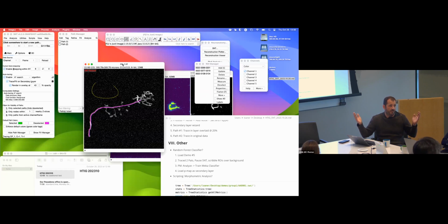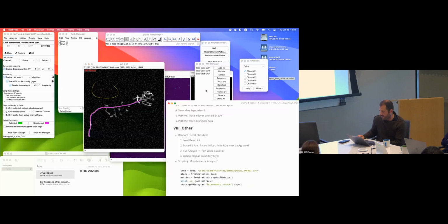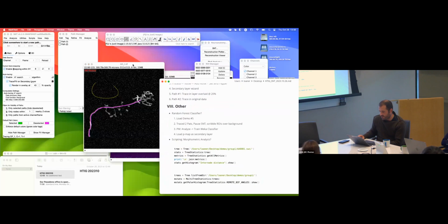The infrastructure is there. Now it's all these random access intervals, all image data structures, so you should be able to use it. I just don't have the bandwidth to do it, and I don't think Cameron has, but if someone wants to use it.